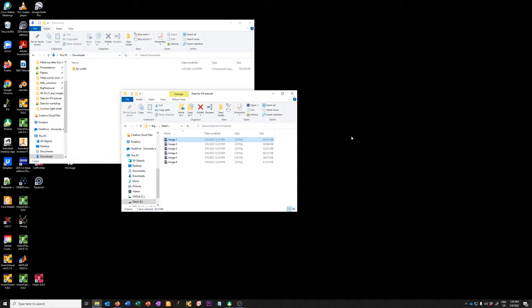This tutorial video will explain how to use the very basic features of Fiji to open images acquired on a microscope, to make basic adjustments to those images, and to get from the raw data that comes out of the microscope images that you can then embed into a presentation, a Word document, or as part of a paper.